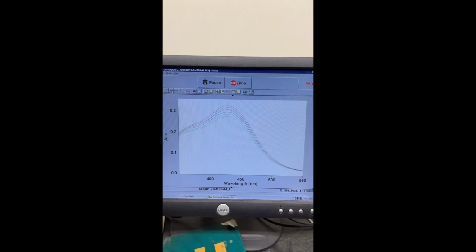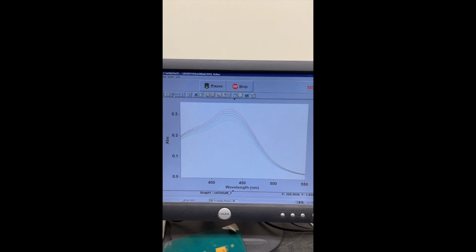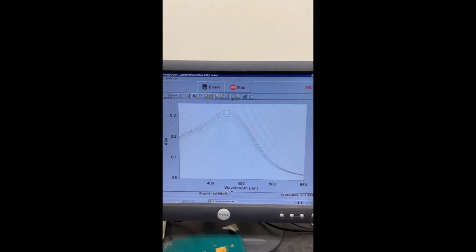We run a spectrum of different wavelengths looking at the peak absorbance, showing us what light our compound blocks out. Each time we run, we see that the absorbance decreases. This is because our compounds prefer to stick together rather than dissolve in the water.